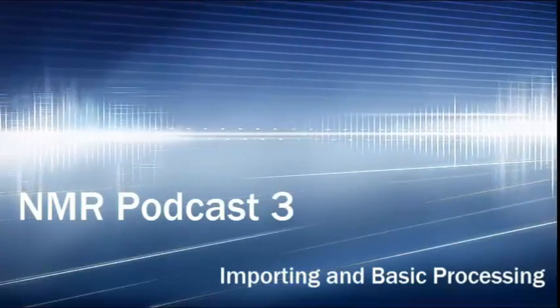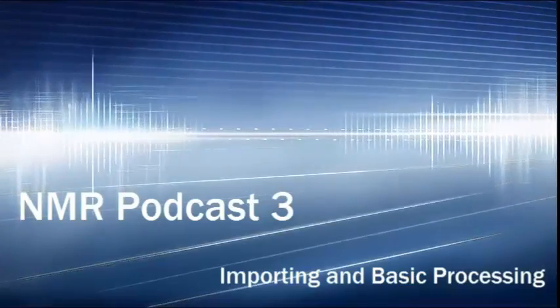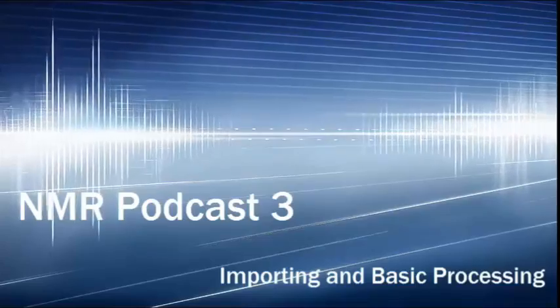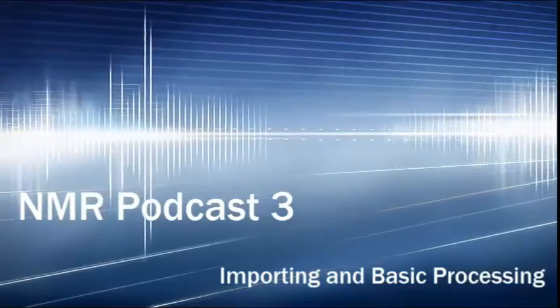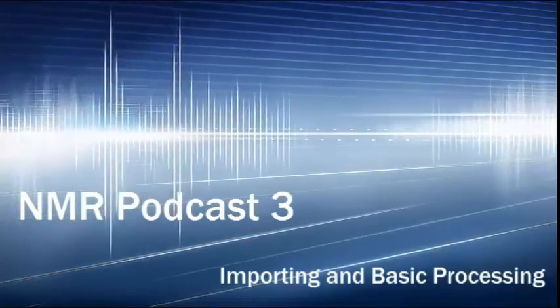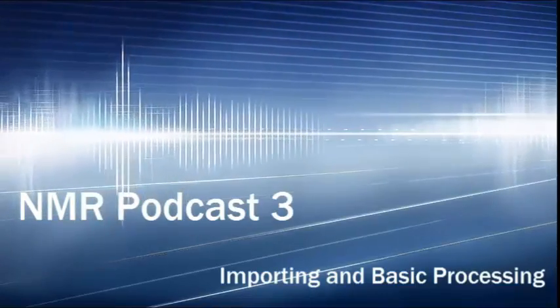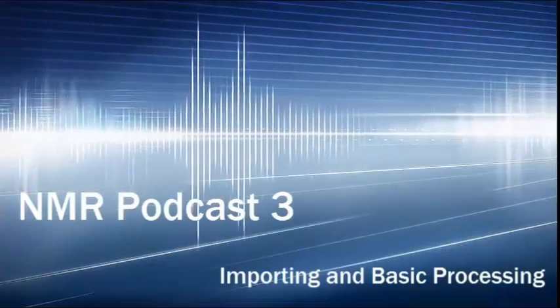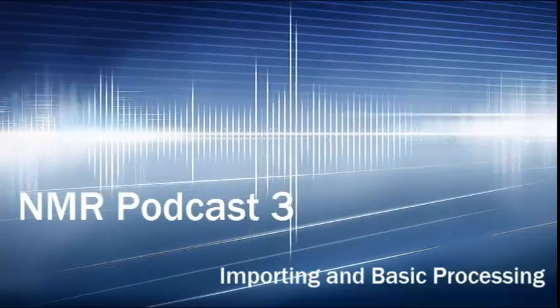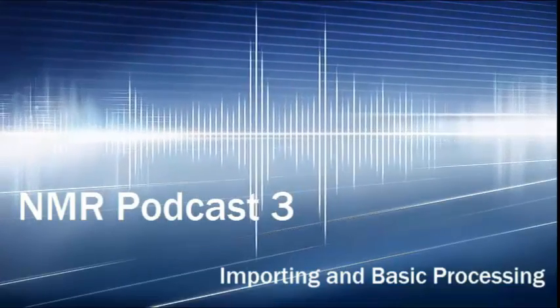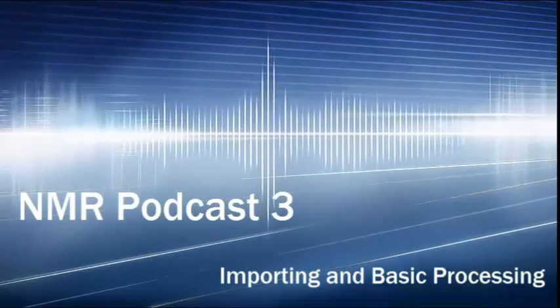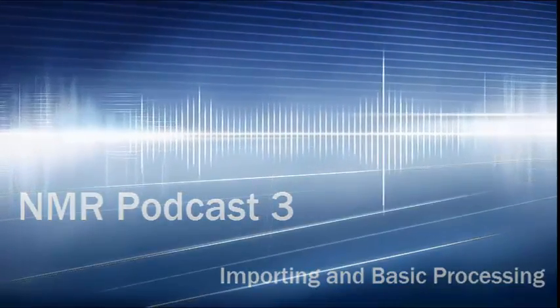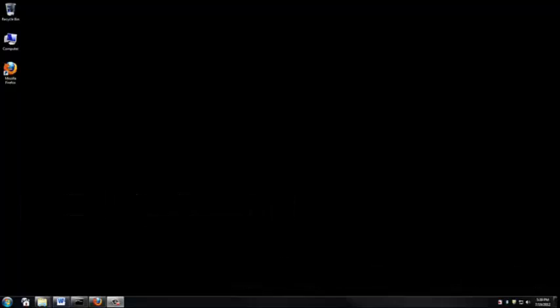Once the NMR has finished my experiments, I automatically receive an email containing my data. This podcast will show you how to extract that data from your email and open it in TopSpin, which is our NMR software. I'll also show you how to do basic processing of your spectrum.